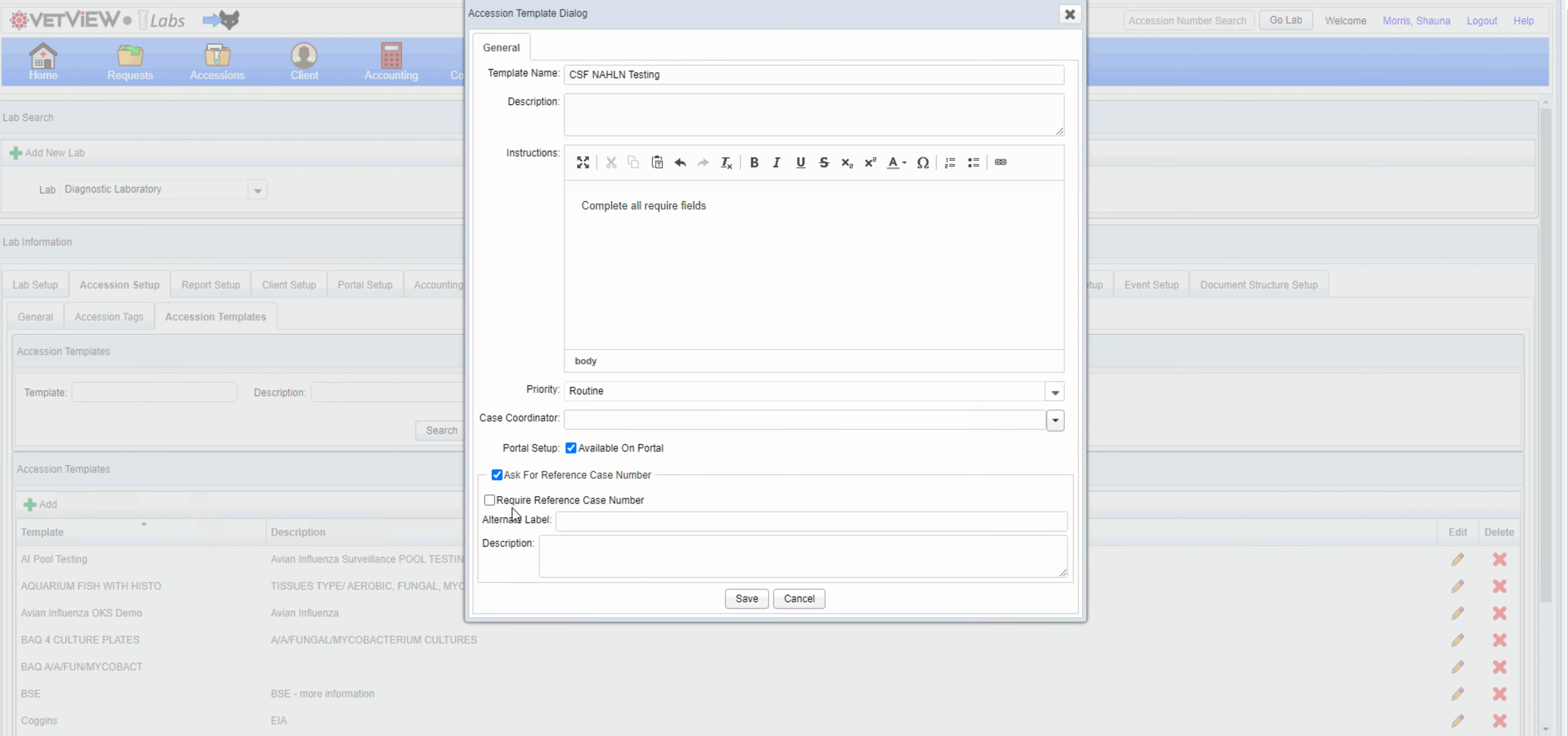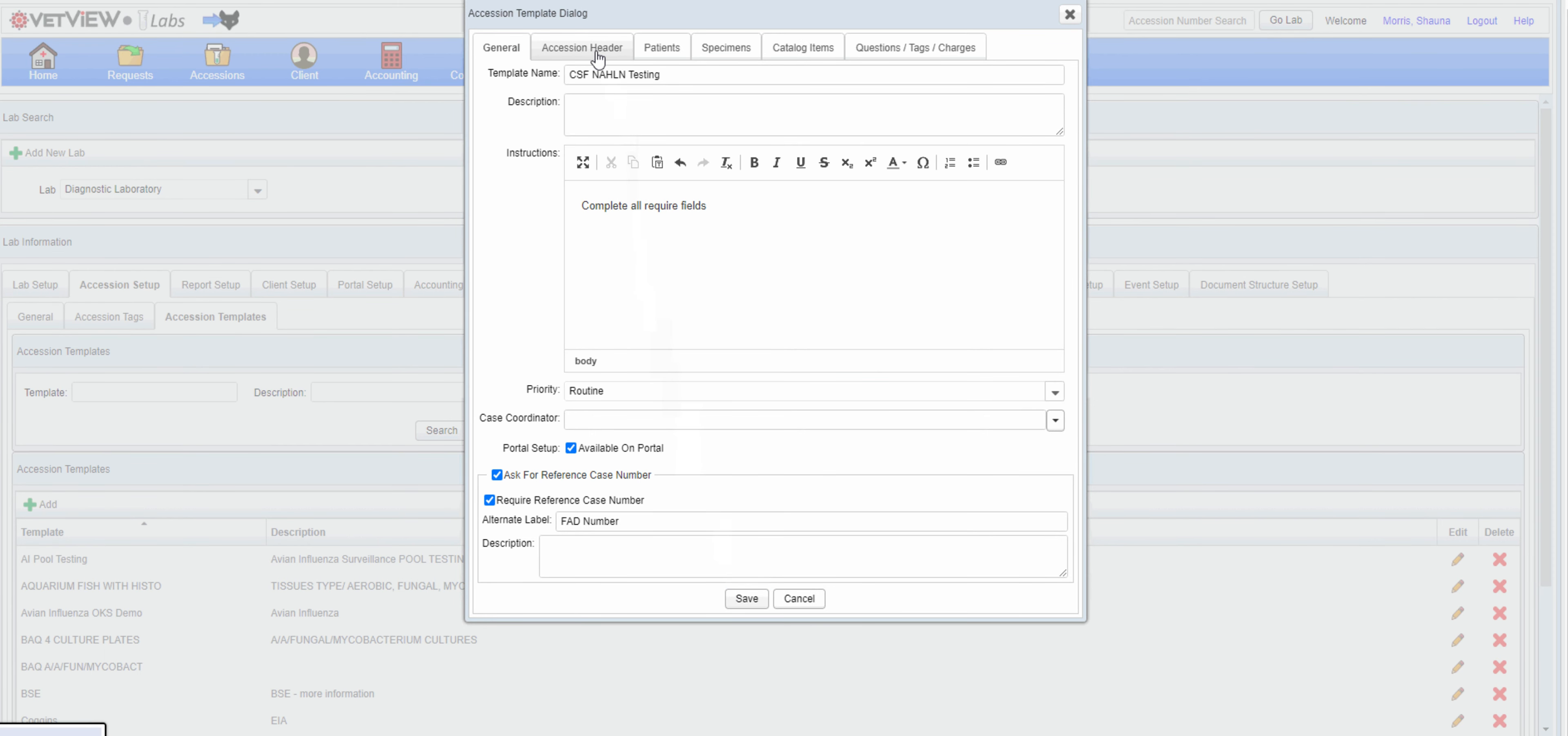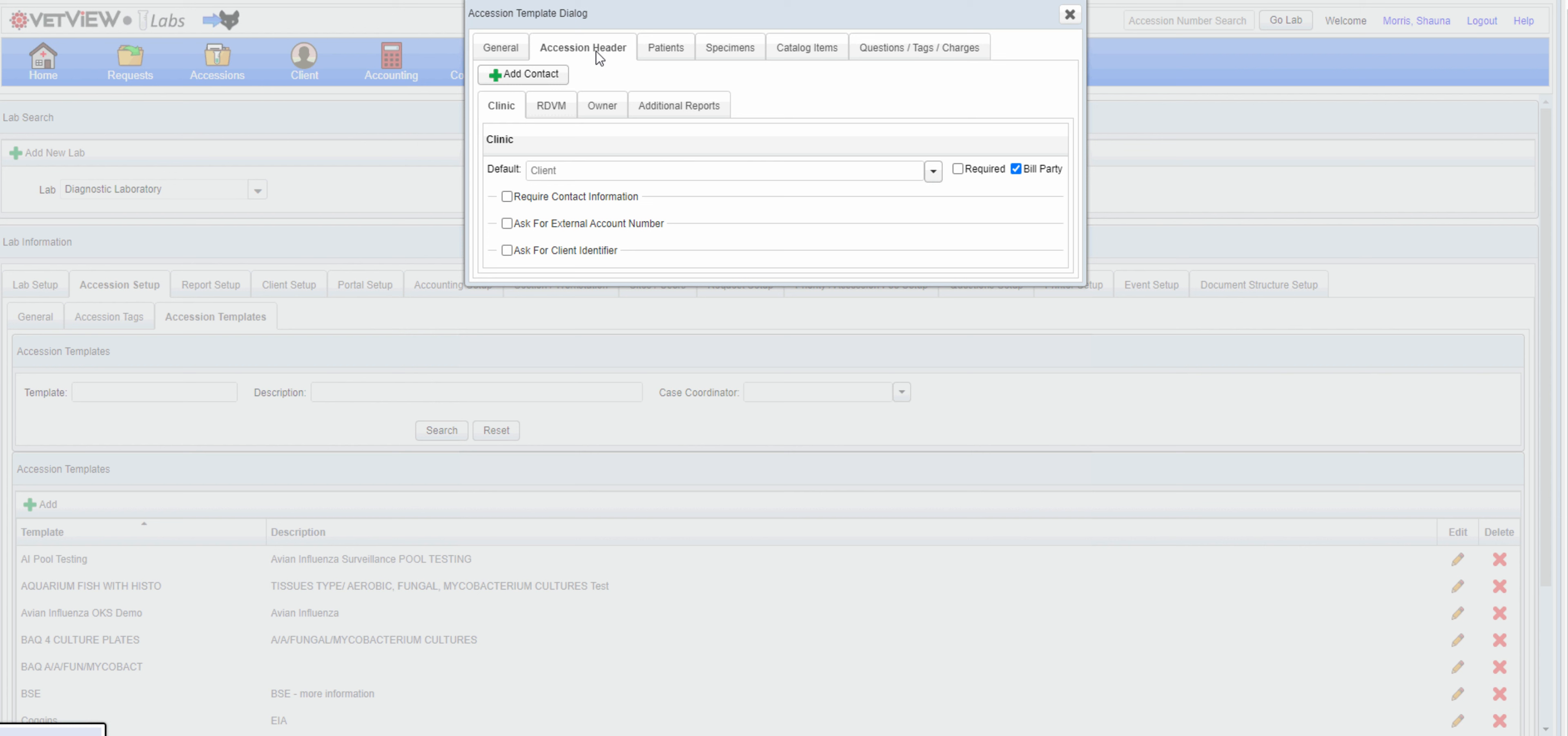Alternate labels allow you to rename the field to a more recognizable term for the submitter. Templates can be as complex or as simple as you would like. You can prompt or pre-populate each section of a case, including veterinarian or owner.